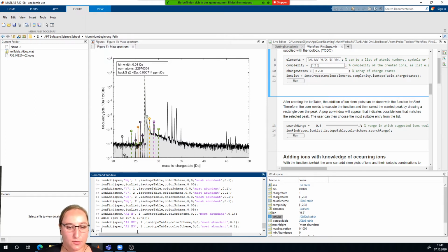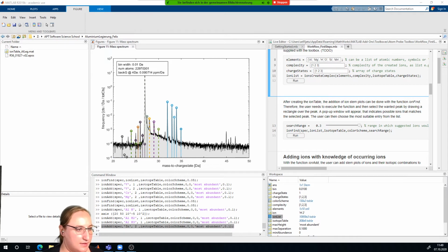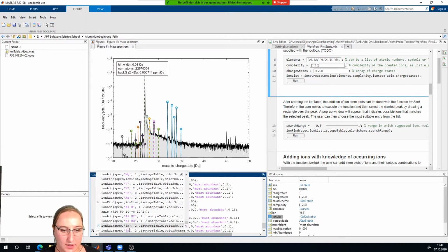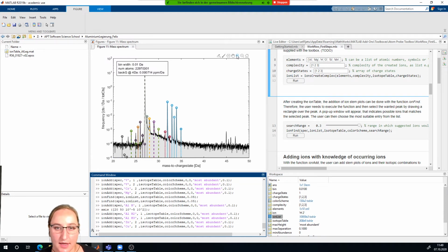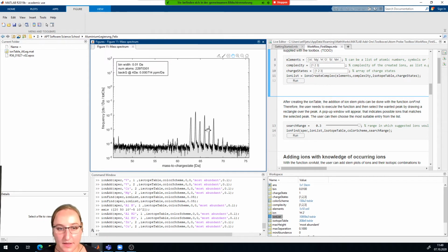Okay, but then let us continue, and here you can see the 3 peaks and the 5 peaks that will match really good with zinc. So we go for zinc, in this case 2 times charged, and okay, and then we have also here some really small copper peaks, so we can also add copper 2 times charged, and we go on to the rest of our peaks.